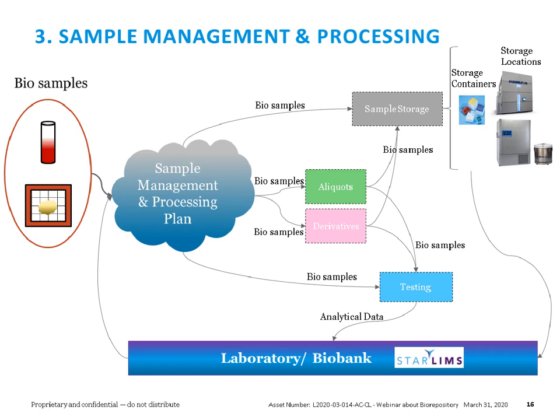And all of these processing steps may not end just with creating the aliquots and creating the derivatives. It could be that all you do is just that and then put them in storage, but it could be that the samples need to go for testing, right? And so that's another piece that the LIMS needs to be able to consider, that perhaps the aliquots or derivatives need to have that.